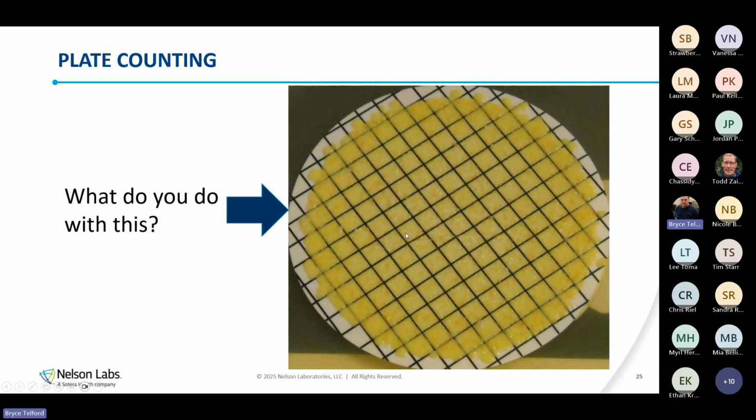But an agar overlay can be a two-edged sword. If we've had motile microorganisms, meaning they can move around, we've done agar overlays before, and the organism basically just goes out from under and spreads across the entire top, not trapped at all. So we can sometimes try what we call full plate agar overlays, where instead of just overlaying a portion, we overlay the whole plate.